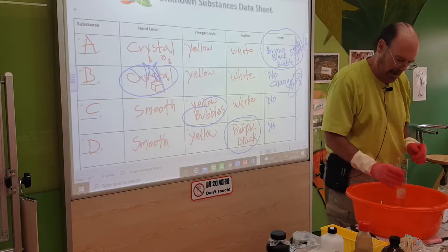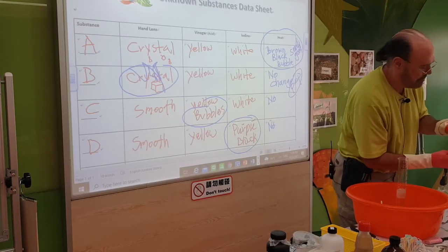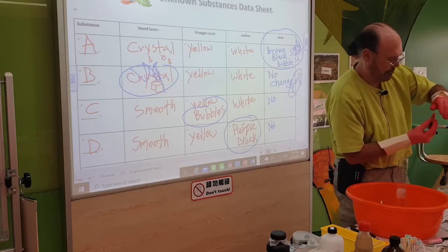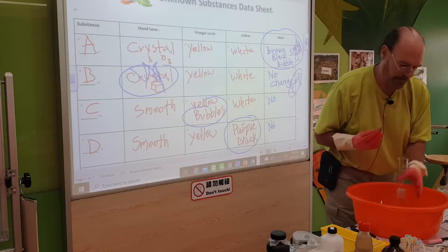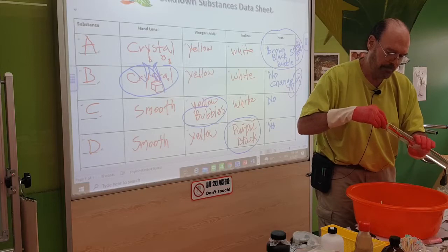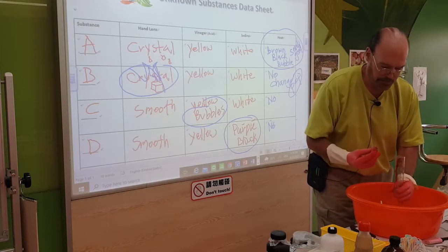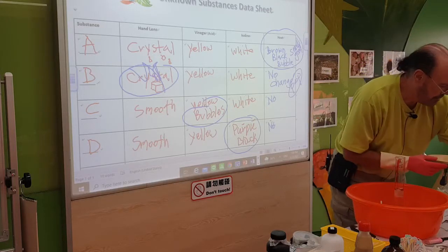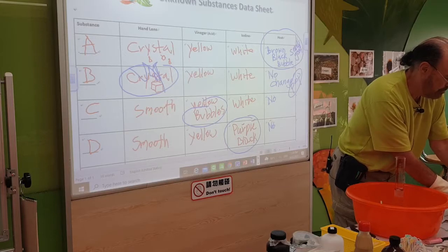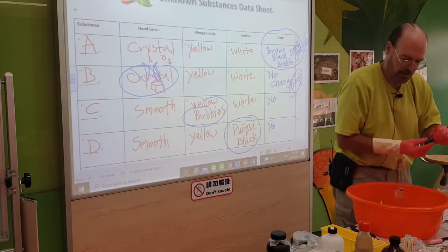Okay, and let's see. Let's add a little color. Go blue.